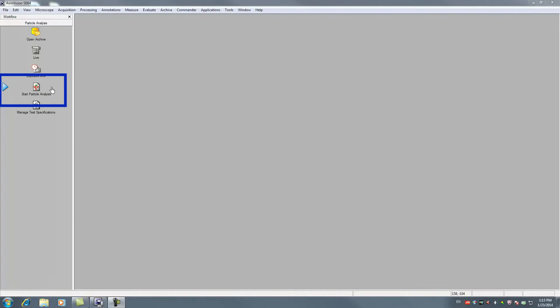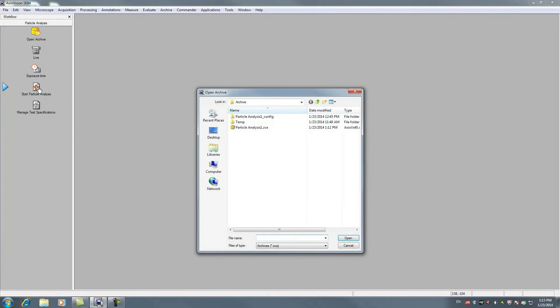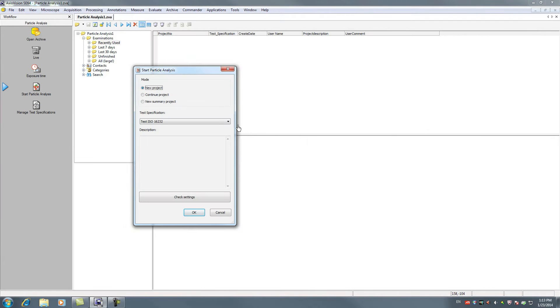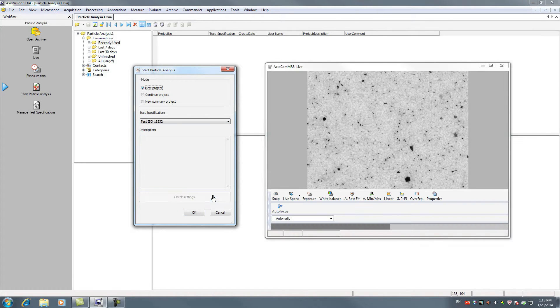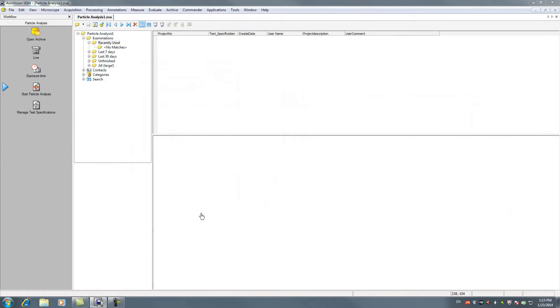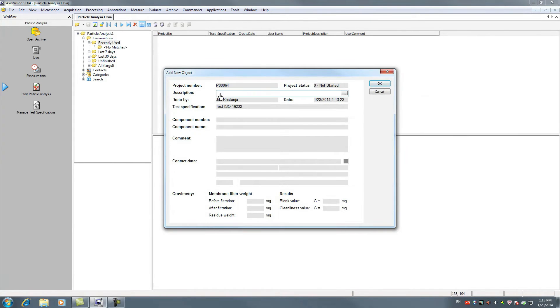Start your filter analysis by clicking Start particle analysis. Select a pre-configured test specification from your archive. Click Check device settings to make the microscope hardware ready to use.